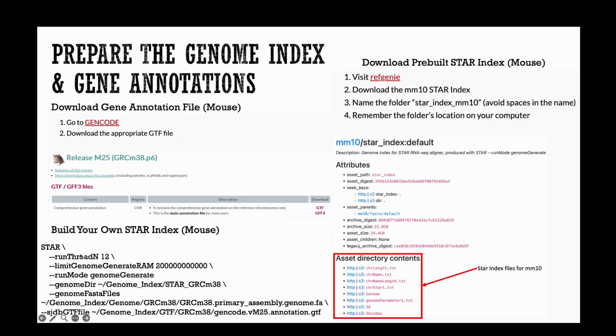So this is the standard format of how to use command line tools. First, we call the command, and then we set the parameters using the options here. We separate the command, options, and input and output files by spaces here.